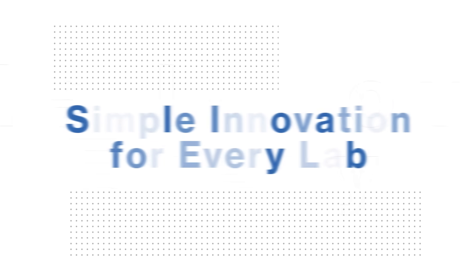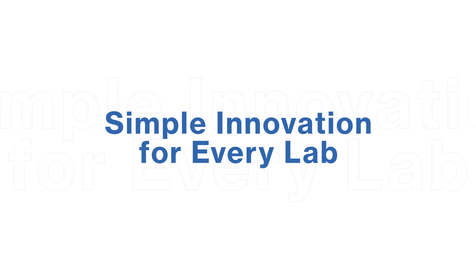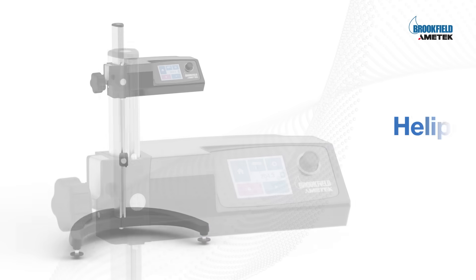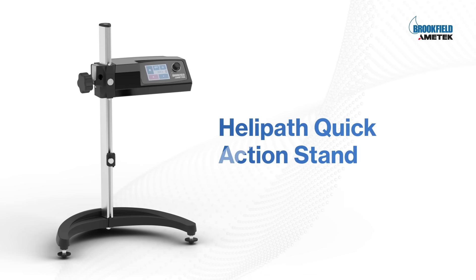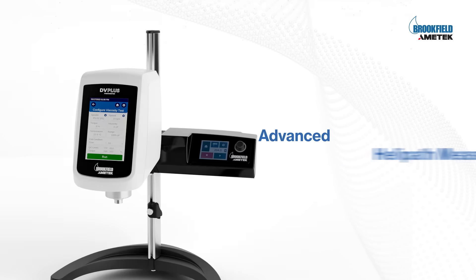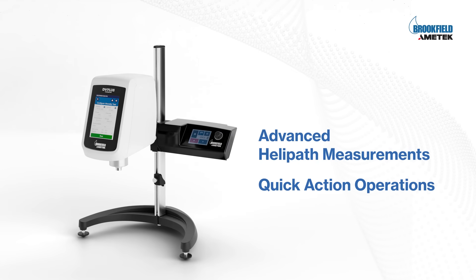First of its kind. Simple innovation for every lab. Introducing the HPQA Helipath Quick Action Stand. Amatec Brookfield's HPQA is for both advanced helipath measurements and quick action operations.